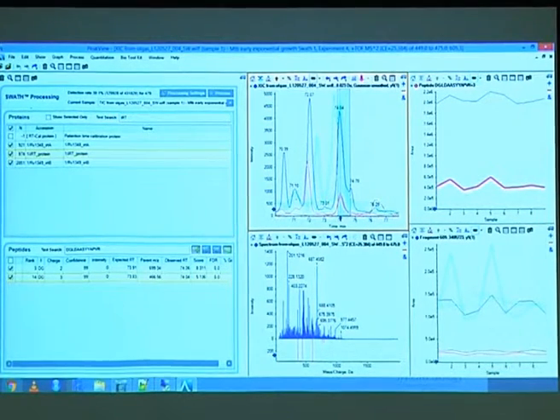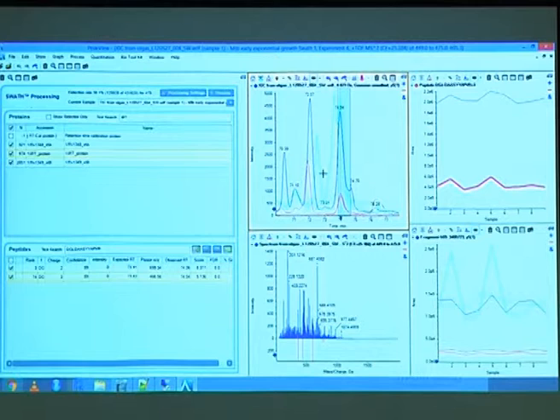Good. The other thing we can test is how bad IDs look. One of the drawbacks here is you will get this data even if the protein is not there, for non-IDs.